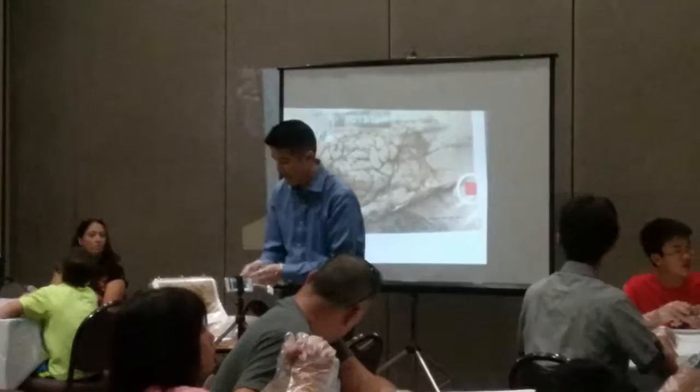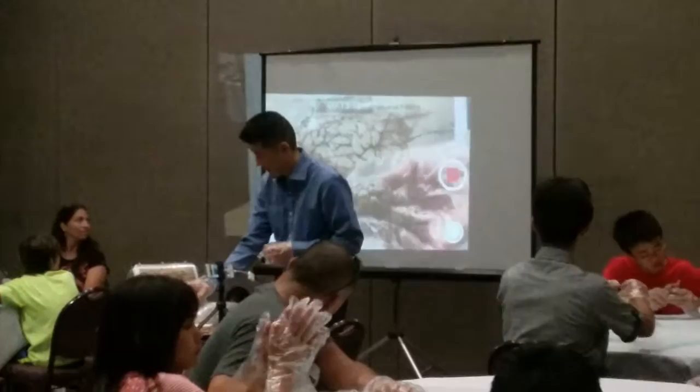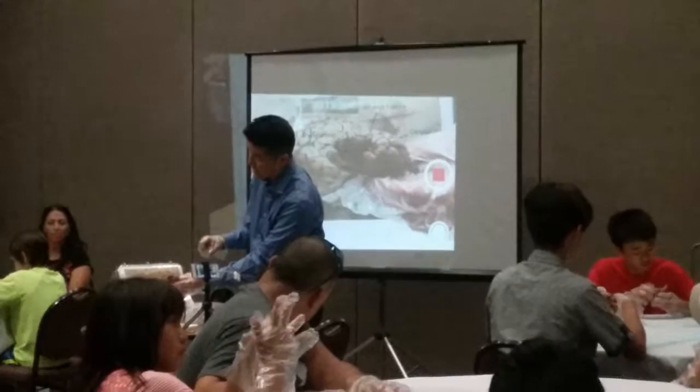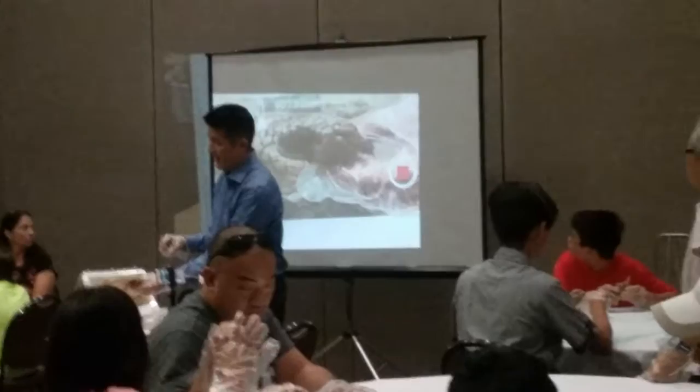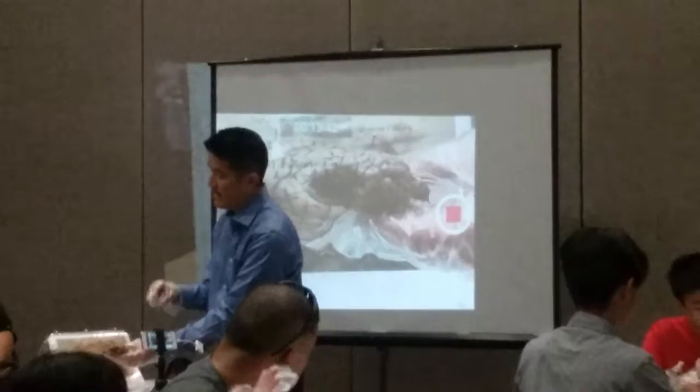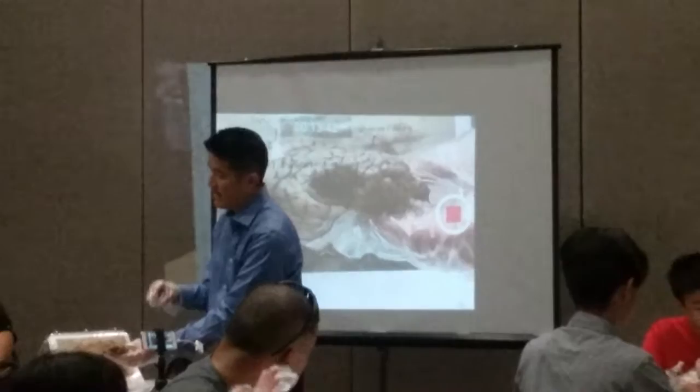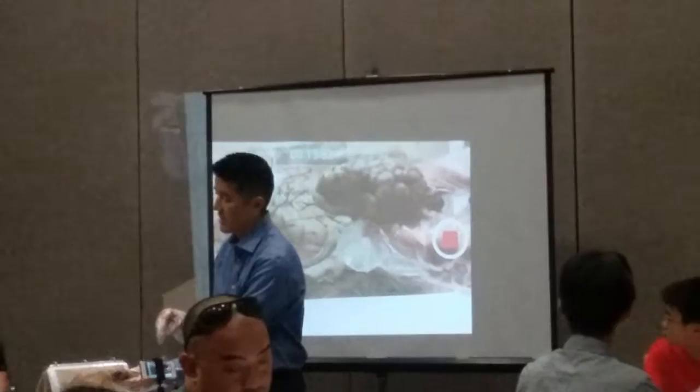This is the side view. Here is the frontal lobe. This is the parietal lobe and the occipital lobe. You'll notice there's no absolute separation between the frontal, parietal, and occipital lobes — even in humans it can be difficult to distinguish them. The difference between the frontal lobe and the parietal lobe relates to a critical brain function: the frontal lobe is mostly motor control, while the parietal lobe handles a lot of sensory processing.